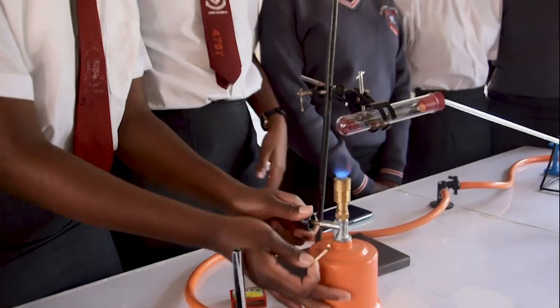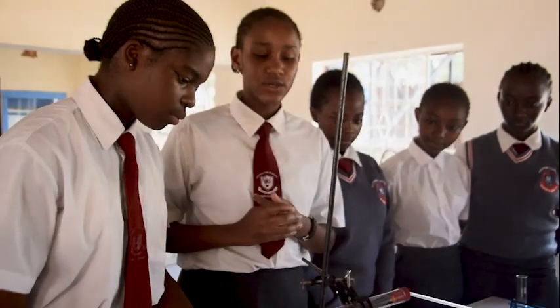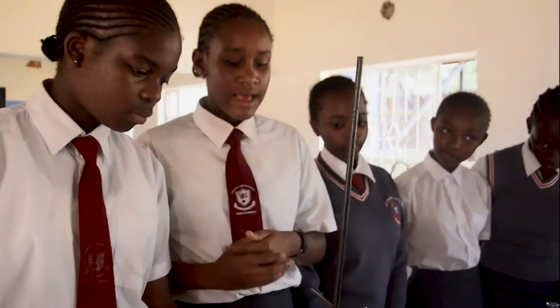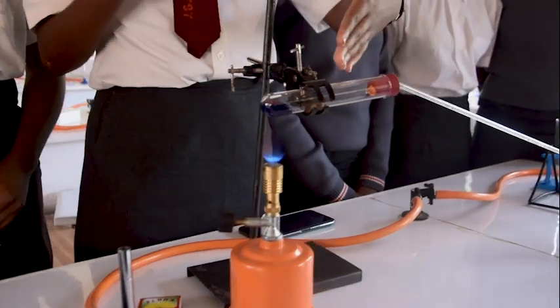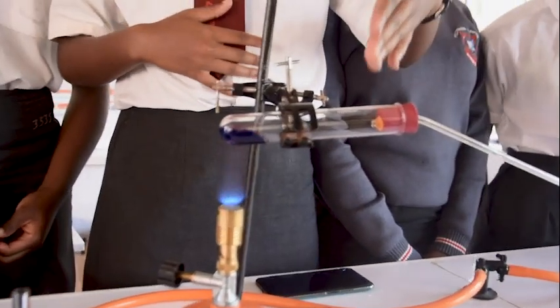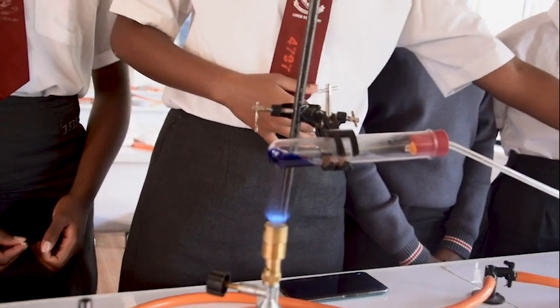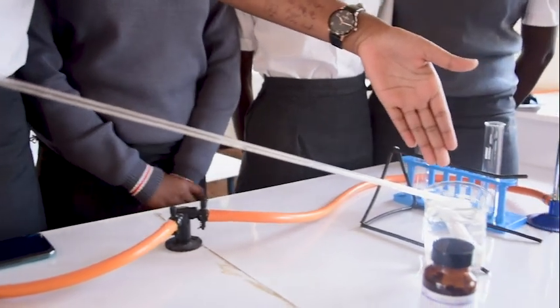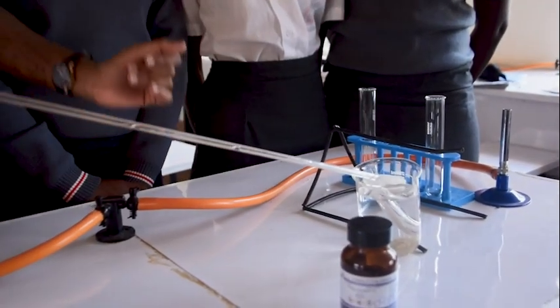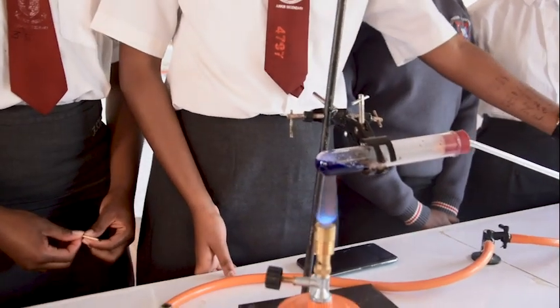As you can see, we have the pink cobalt 2 chloride, which is hydrated, containing water of crystallization. As it's being heated, you'll start seeing that water vapor moves from the hydrated cobalt 2 chloride down the delivery tube, up to the test tube hosted in the beaker having ice cold water. The reason behind us having the ice cold water is simple: to condense the water vapor.